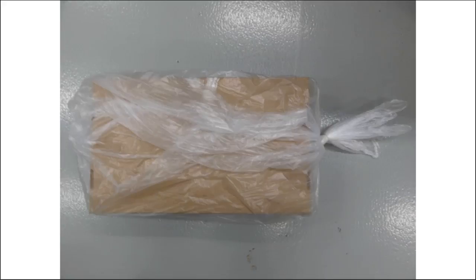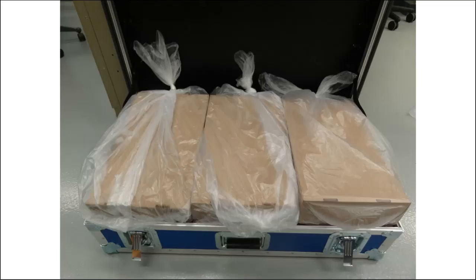Just make it apparent to us that you're going to take clods as well as bulk samples, so we'll send you that stuff. But these are light bags, and so if you have heavier, bigger trash bags, you won't be able to pack all your 6 clod boxes into a clod trunk. And here's the next picture of the clod trunk with 6 clod boxes in it, that all have liners on them.